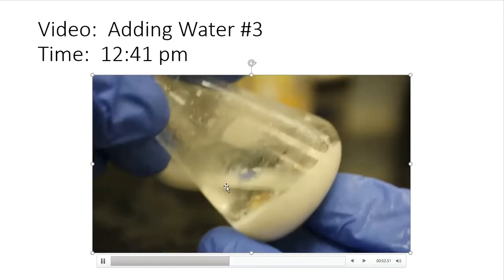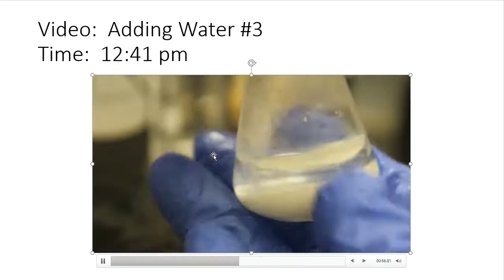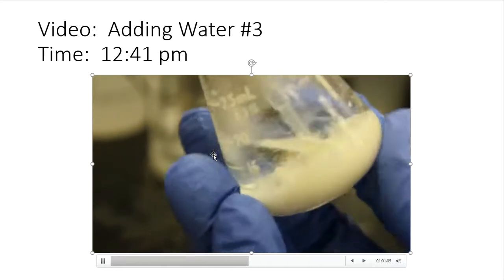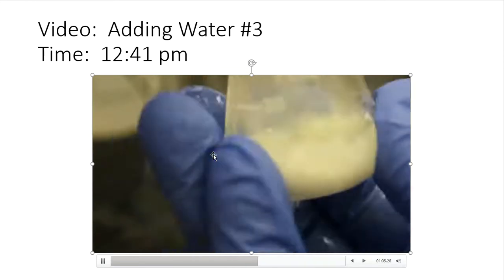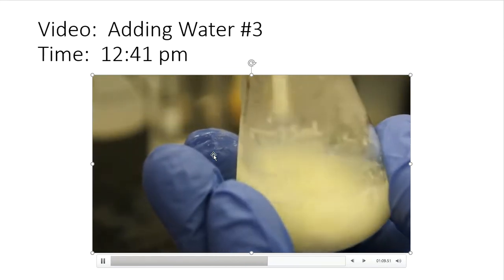And there I was trying to break up the solid chunk. I really don't like it when that happens, especially with the addition of the water. So I'm going to take a stirring rod or a plastic pipetter and stir that up a little bit, just so I can break up that solid chunk. I really don't like to see that.